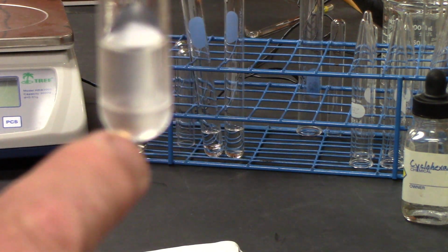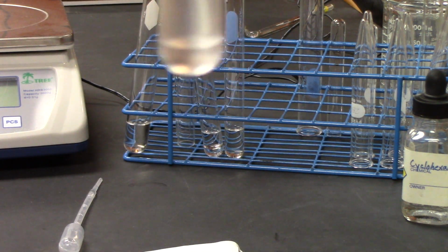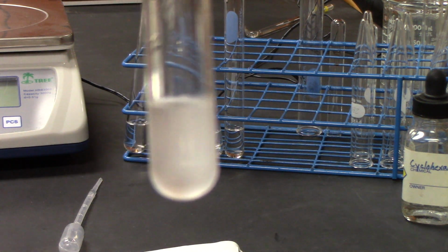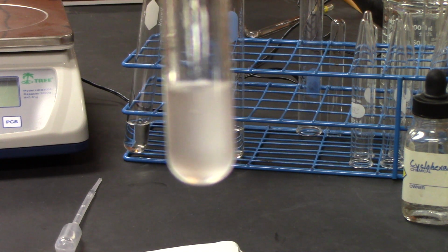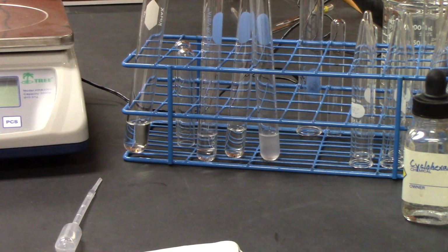You see that layer there. So it looks like it's insoluble in the ethanol or ethyl alcohol. It bubbles up and it looks like they just don't mix. So our results, we're going to say that the unknown is insoluble in ethyl alcohol. So we have three results from the first experiment: insoluble in water, soluble in cyclohexane, and insoluble in ethyl alcohol.